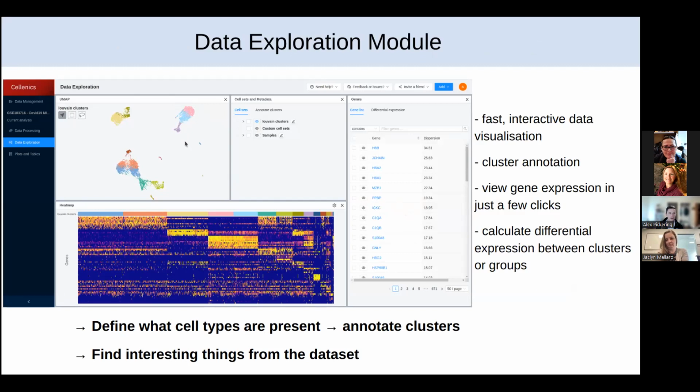This is also going to be where you run differential expression analyses. That means you're running a comparison between two groups of samples. So think treated versus control samples, and you're doing it in a particular group of cells. That's one of the promises of single cell RNA-seq. And then after you get your differential expression results, you can run a pathway analysis on those results. So you're going to do that here as well.